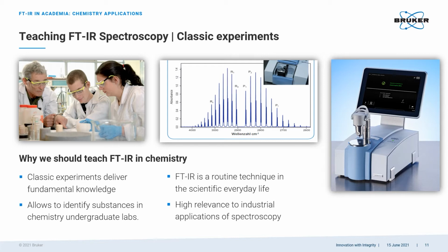And besides this, it has practical use in many organic and inorganic labs where students follow synthetic routes and need to characterize intermediates. Usually this involves multiple techniques, but none so fast and safe as IR spectroscopy. The best part is that the technology is so tough that most clumsy students will easily achieve analytical success, whereas handling an NMR is a more delicate thing.